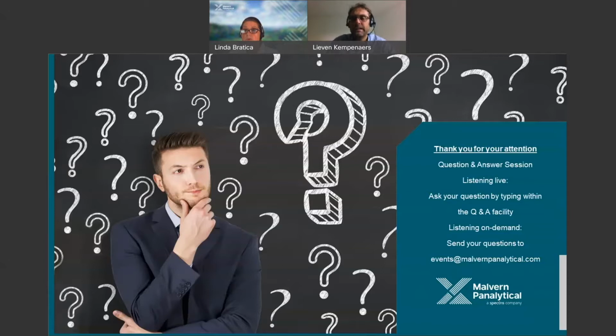Let's see. I always say it depends, but of course that doesn't work as an answer. Looking at those elements, zinc, manganese, copper, iron, yes, those are easy elements, especially for ED-XRF. That's in the sweet spot of the detector, so there's no issue there.